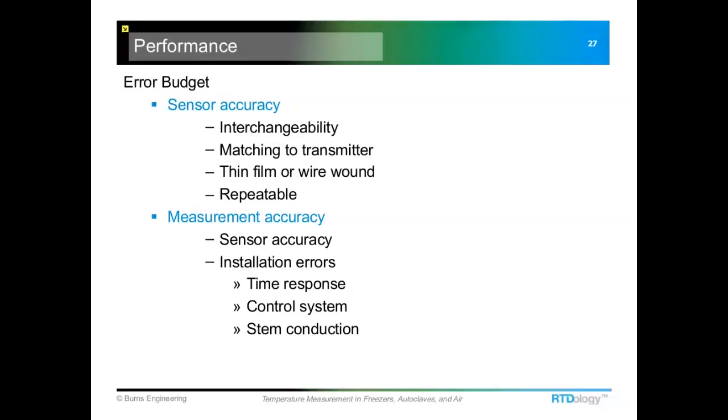For people who aren't familiar, they're typically high humidity, pressurized test chambers that are trying to accelerate the findings. So it would be similar, but there's some special considerations that would need to be taken into account based upon the specifics of the application.